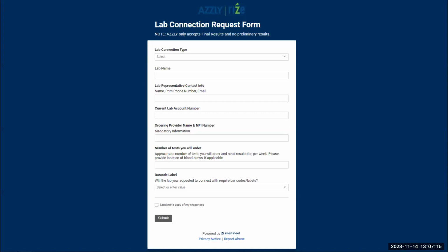Is this going to be just for any future ones, not our current interfaces, right? No, if you've got a bidirectional interface now, this new user interface for the end user will be live for them to use for any current bidirectionals.